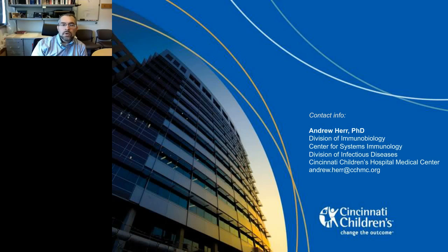Oh, in absorbance only AUC. Well, there are ways to do fluorescence analysis. That is a specialized thing. I know that there are some aftermarket things. I actually need to talk with my Beckman colleagues to know what's current. So there are some specialized ways to use fluorescence, but in general, absorbance is probably the best way to go. As I said, I would guess that most of the time people are analyzing proteins in the micromolar range.